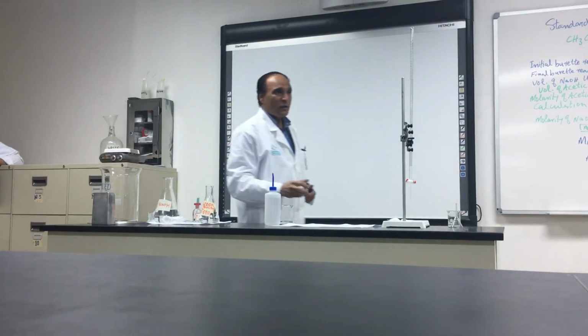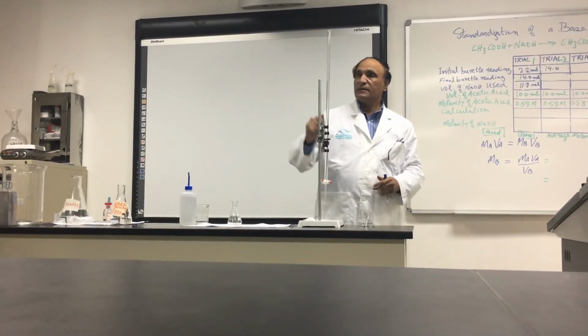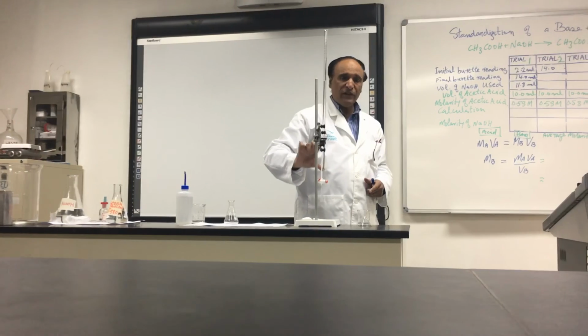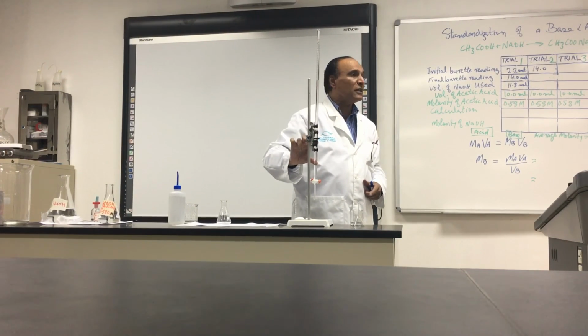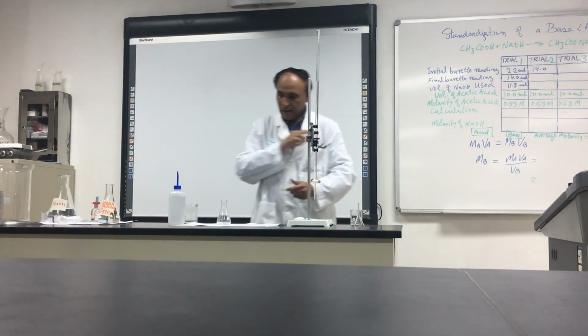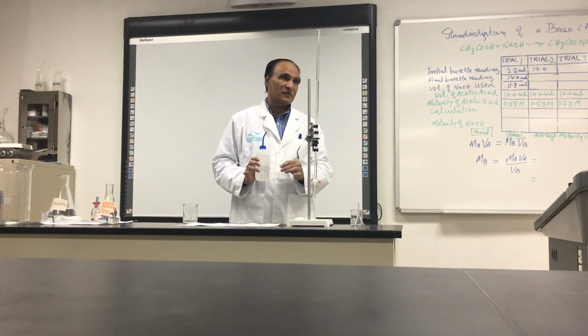Okay, so boys, if this is the volume you use, do you need to fill it? No need, because the second time you will use this one. You can even do 3 titrations with one. So now let the second student do the titration.